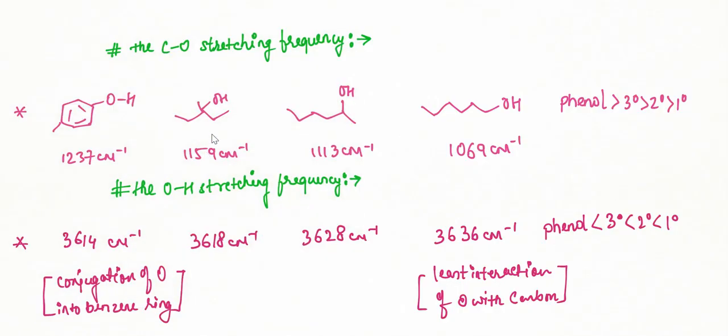Alright guys, so now we are going to move forward, and now we are going to look at the carbon-oxygen stretching frequency, what can be the different values for different alcohols, right? So as I have written over here, I've just generalized it, that the carbon-oxygen stretching frequency for phenol is greater than 3 degree alcohol, then 2 degree alcohol, then 1 degree alcohol.